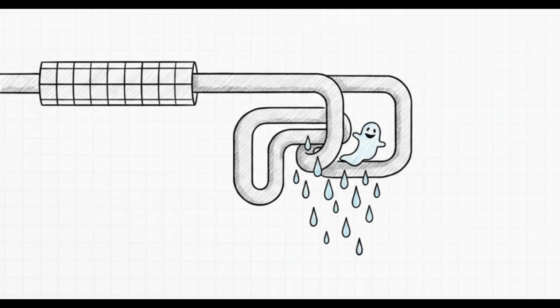To give you a specific case in point, there was one facility that spent immense resources before finally finding a gram-negative bacteria lurking in dryer condensate. These bacteria are notorious for their tough, protective outer membranes, and this colony was way outside the routine sampling grid. The facility looked at the cleanroom air, purified water, raw materials, everything within their normal protocols. But the reservoir was ultimately found hidden deep inside hard-to-inspect pipework. It really goes to show that if your sampling grid isn't looking in the exact right physical location, the ghost is just going to keep haunting you.